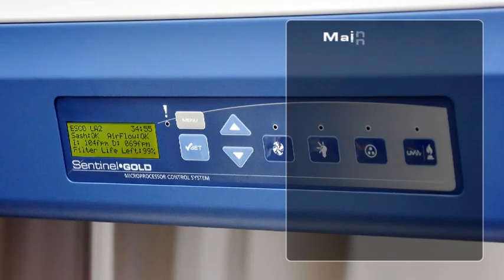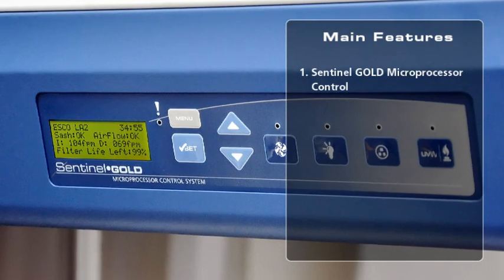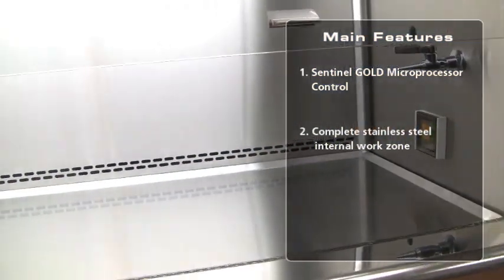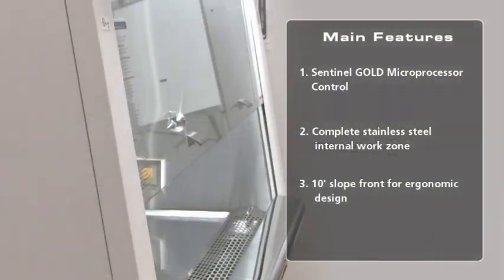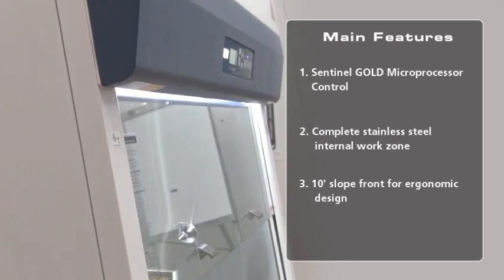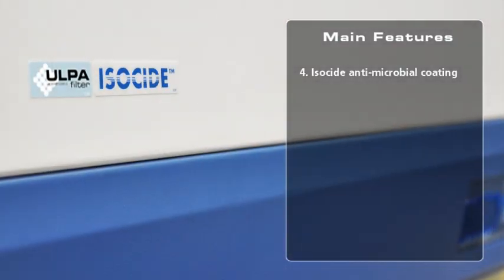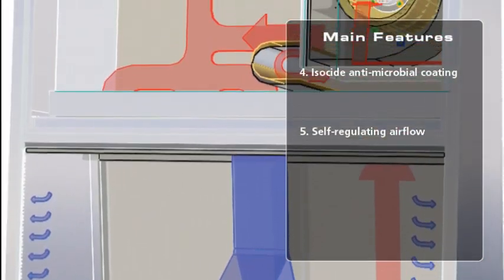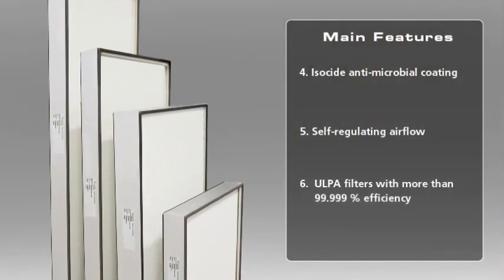The key features include a fully configurable state-of-the-art microprocessor control, multiple language selection, an attractive complete stainless steel internal work zone, an ergonomic 10-degree sloped front, isoside antimicrobial coating on the cabinet exterior, a self-regulating airflow design that maintains safe airflow velocity, and superior mini-pleat ULPA filters.